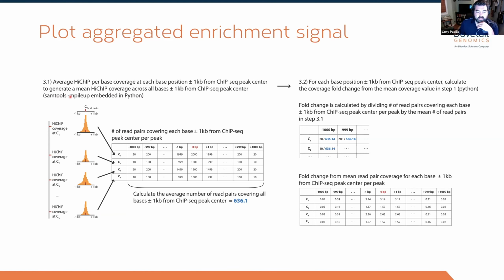And this is done with SAMtools mpileup, embedded within a Python script the way that we do it. There's other ways to do it. This is just one way that we've shown here.